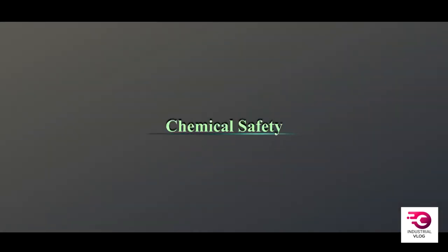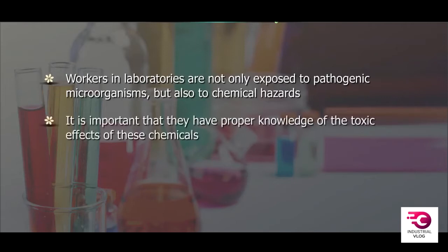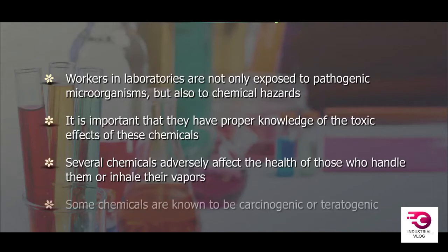Chemical safety. Workers in laboratories are not only exposed to pathogenic microorganisms but also to chemical hazards. It is important that they have proper knowledge of the toxic effects of these chemicals. Several chemicals adversely affect the health of those who handle them or inhale their vapors. Some chemicals are known to be carcinogenic or teratogenic.